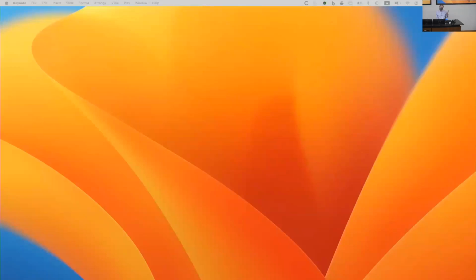If you have one N in a read, sometimes you get it, although these days, like I said, it's not super common. This is a little bit of a hand-wavy explanation. One N in a read is not great.